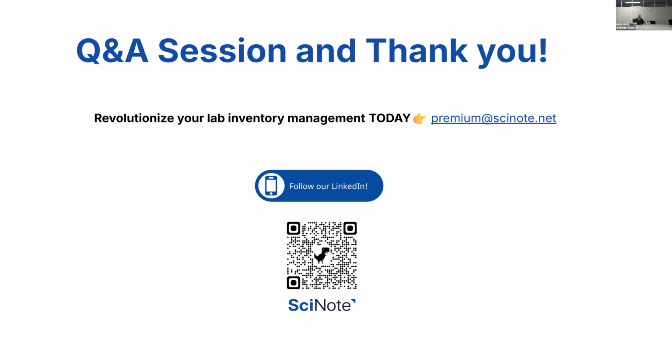And Mayur asks, why is the stock quantity not deducted after adding new stock? That sounds like two things: either it's a bug or it's being used incorrectly. If you do have stock management, we didn't hear this often, at least I didn't. So Mayur, please reach out to support@SciNote.net, and one of our customer success team members will reach out and provide the information, and we're going to do some research as to why this wouldn't deduct.